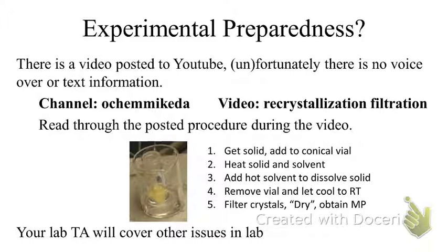Why do we want to keep the solid hot as well? What happens if we take our hot solvent and add it to our solid, but it's not on the hot plate? What happens to the temperature? I think it does decrease. It cools down. What happens to the solubility of your compound when it's cold? It reduces. It's very, very low. The idea is we have to get everything to dissolve first. We want to make sure everything stays hot. Okay? So we'll add our very hot solvent, it should be boiling, to our crystals until it completely dissolves.